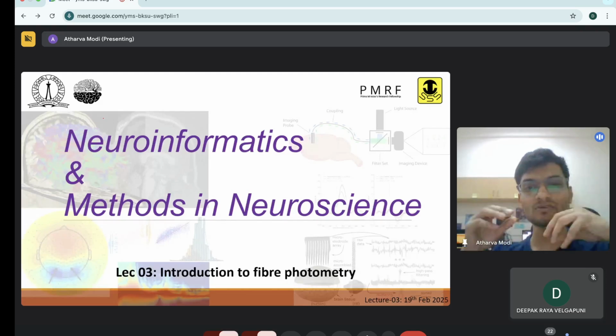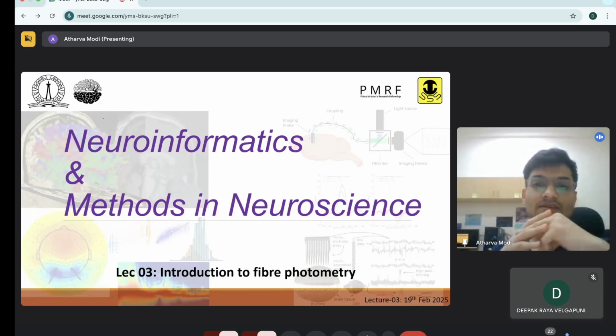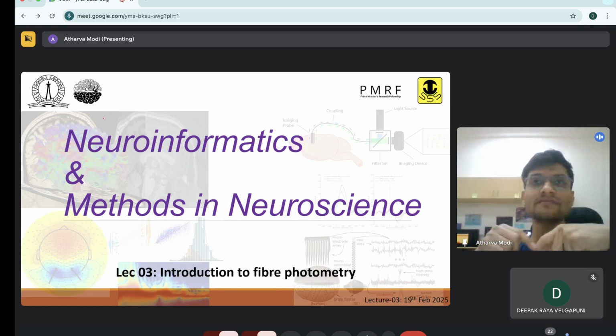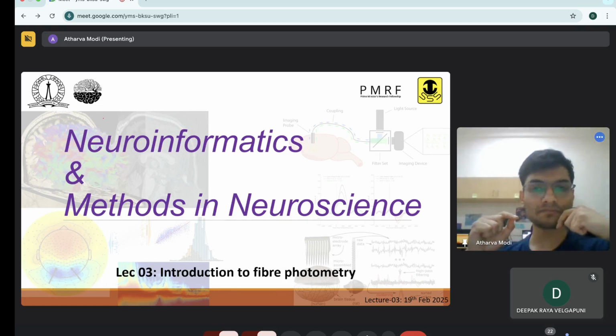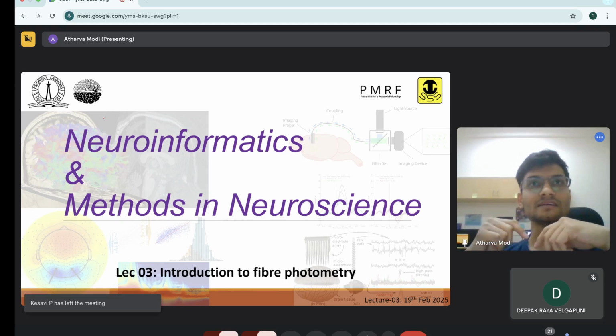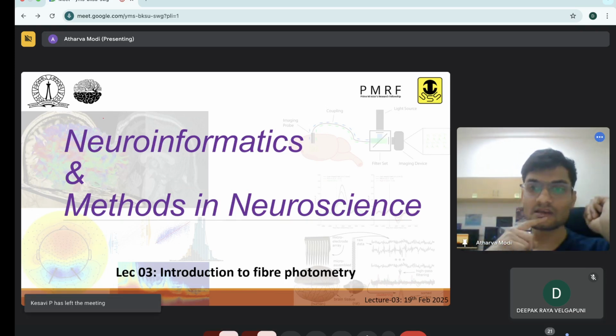But what I am going to cover is also a very innovative, very intriguing technique where we can record different kinds of brain activity, we'll see what different kinds mean, using light. So by shining light inside the brain.